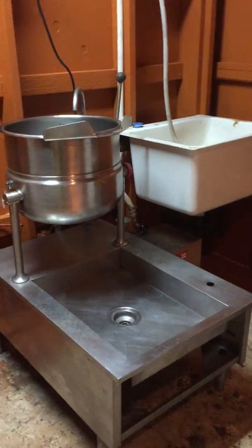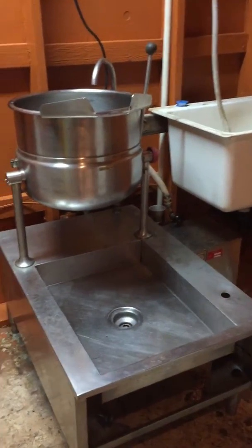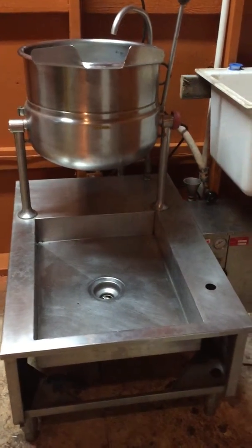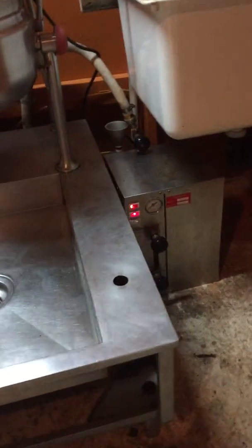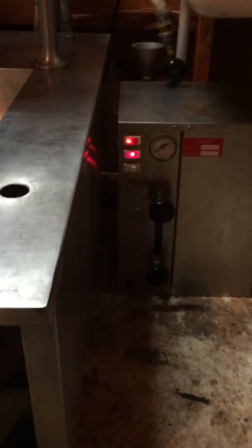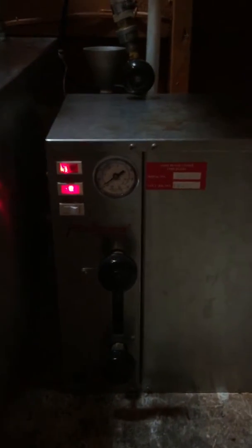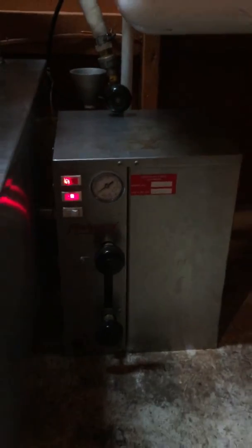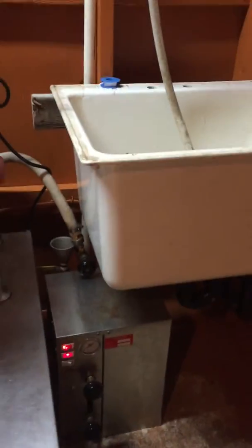Here I'm doing a test run right now. I've got the steamer going and we're going to see how quick it heats up the kettle. It seems like it takes a little while for this thing to get going — it's probably been about 10-15 minutes now and nothing's getting real hot.